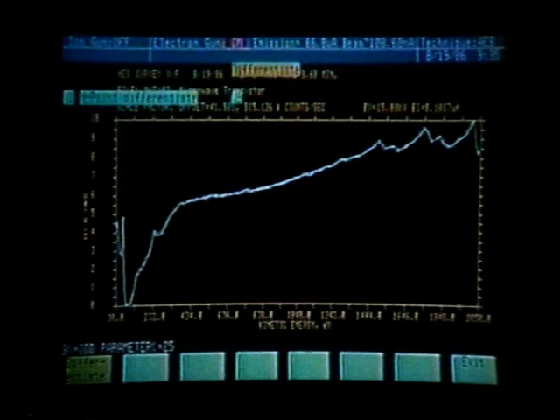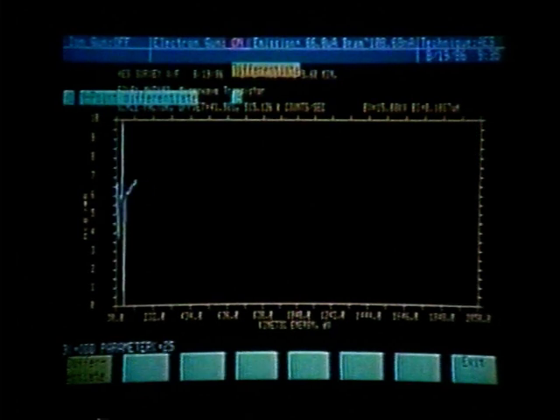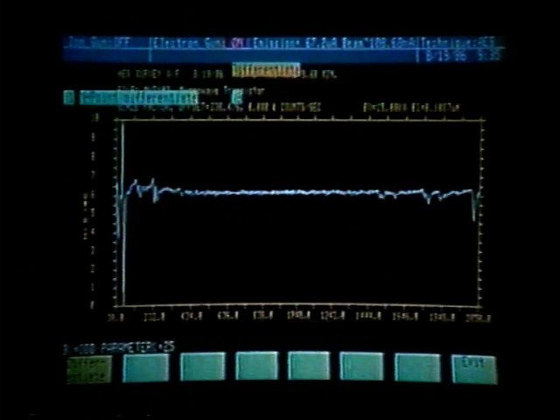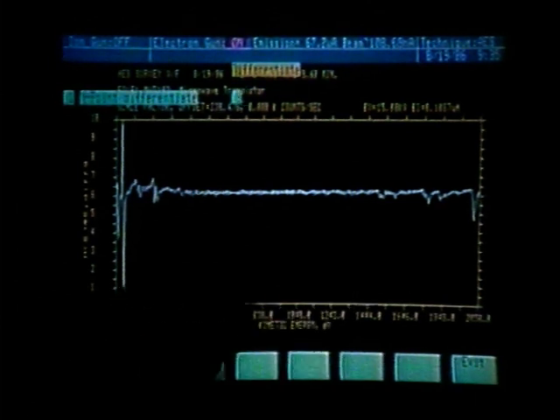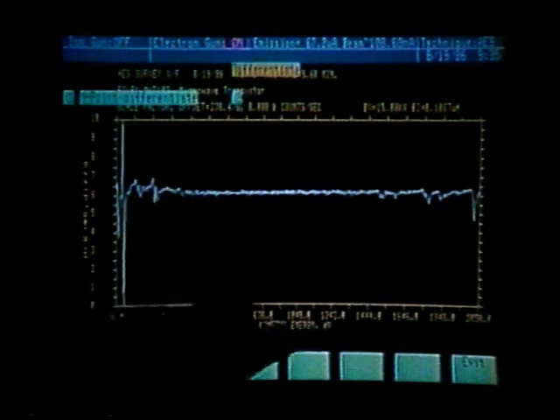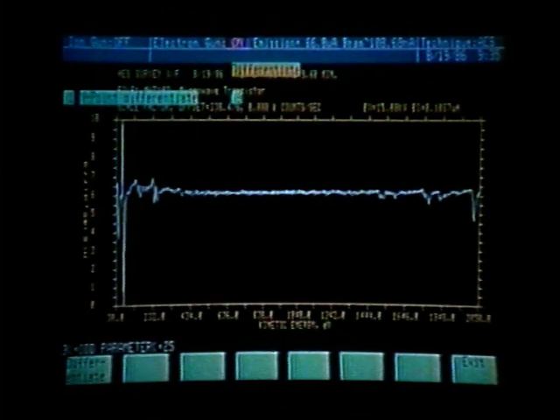We are now doing a 9-point differentiation. We can see that the signal to noise is quite good using a 9-point differentiation, so we do not need to utilize the smooth routine. We can now exit using soft key number 8.